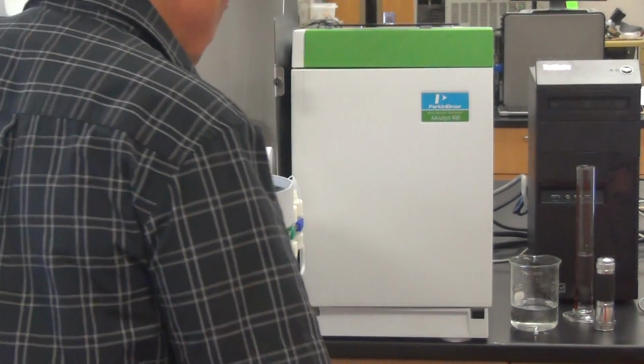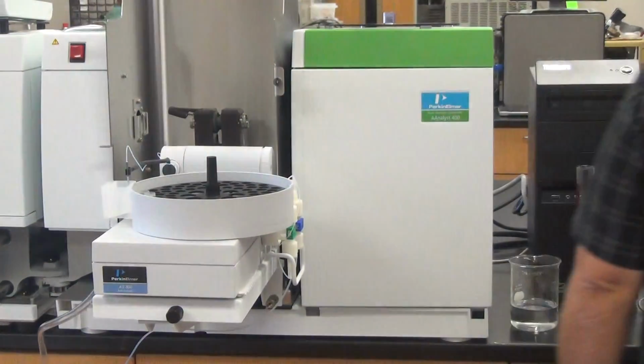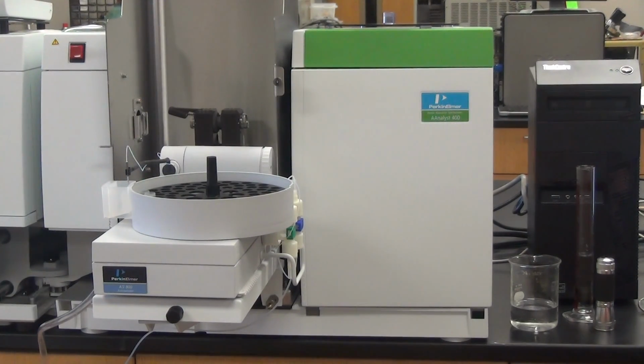Okay, so now we've got the first line. Now I have windows in, so I had 50 counts, and I have 5. Remember I told you if you had the windows, you just go from minimum. So it sees the windows. Now we go to align tip, and it says, what do you want to do? I want to line the tip in the graphite tube. And I go next.